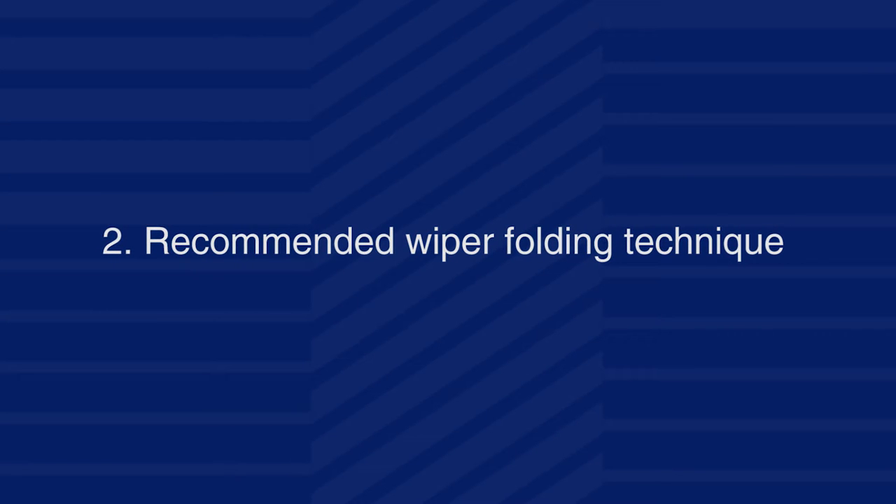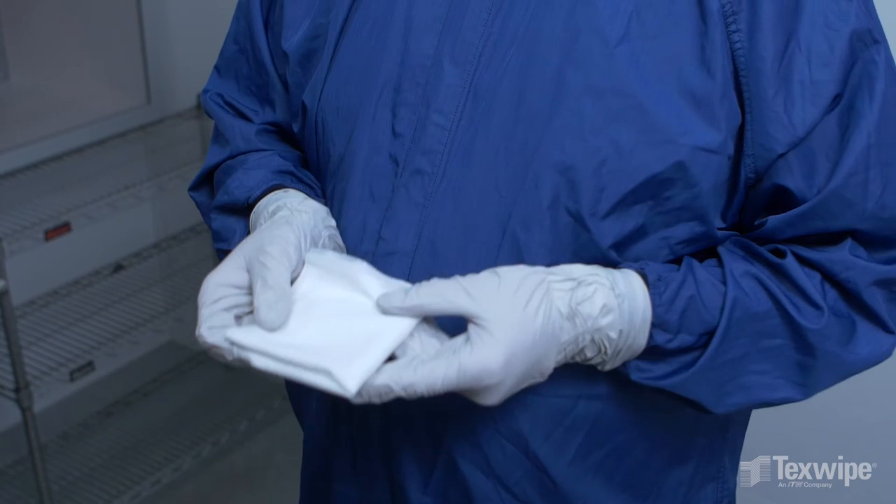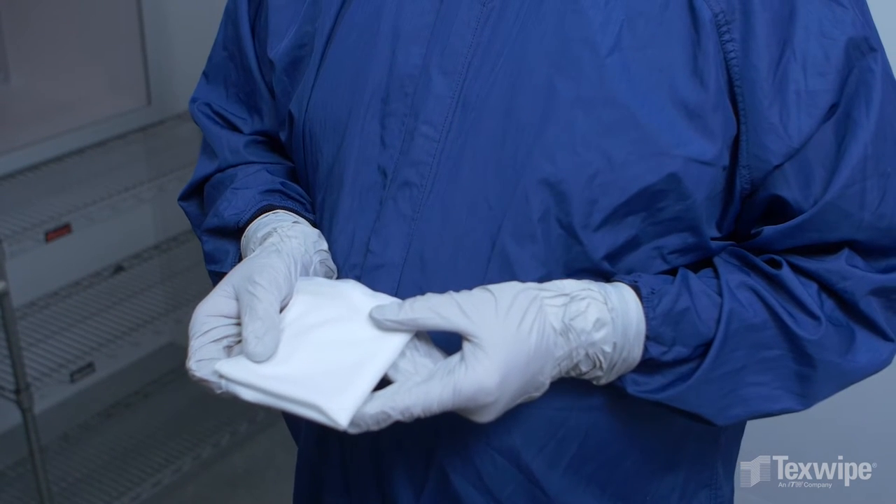The second step is the recommended wiper folding technique. Fold the wiper in half, then fold in half again to create a quarter-folded wiper.